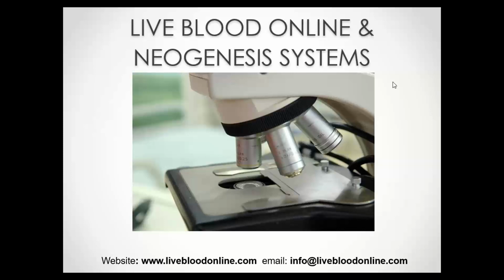It would seem that a lot of suppliers of live blood analysis microscopes claim that their microscopes are good for live blood analysis and dark field microscopy, but it would seem that they don't actually know the specifications for live blood analysis, so they're not deliberately misleading. It's a very specialized subject, isn't it?